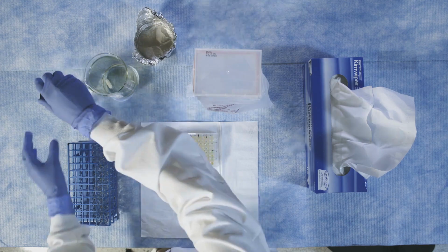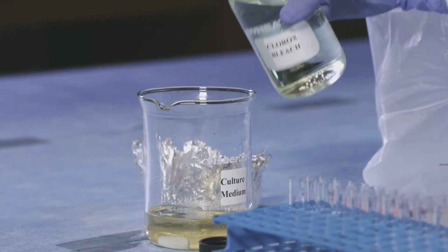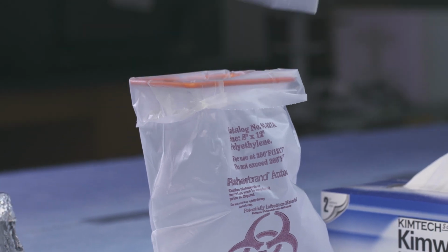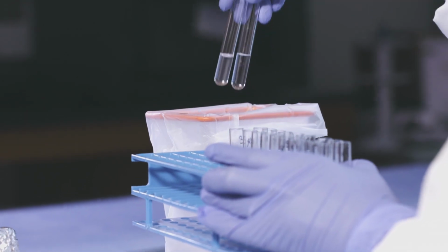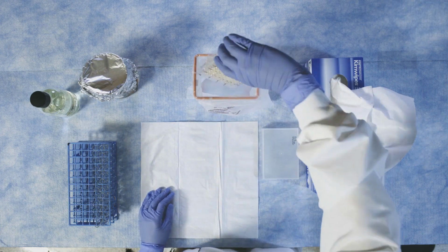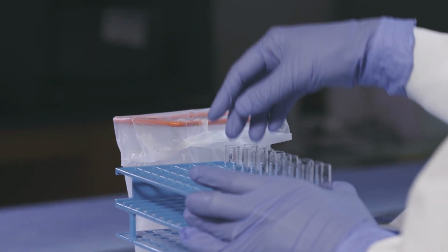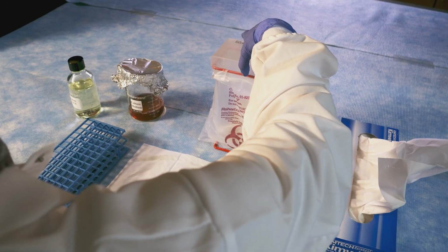Add bleach to the leftover folate assay medium containing the microorganism for a final concentration of approximately 10% and let it sit for 30 minutes to inactivate the microorganism. Place disposable plastic, glass, and paper items, pipette tips, vials, glass tubes, gloves, microplates, disposable bench liners, etc., that may have come into contact with serum or blood into a biohazard autoclave bag and keep the bags in appropriate containers until they are autoclaved and properly disposed.